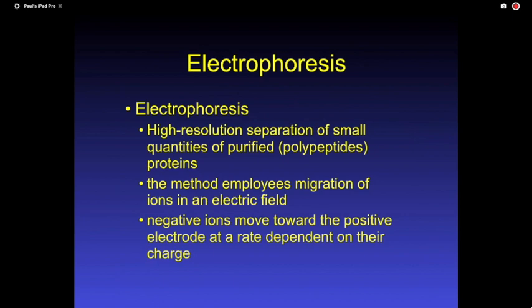Usually it takes a combination of 2 to 3 to 4 different separation techniques to get to a purified protein, a single protein which you can use to do your studies. Okay? But they're used in conjunction. And which ones you use depends upon, again, you hope someone's isolated your protein before and you just find out their protocol, they figured it out. If not, you do a lot of work to figure out how to isolate your own protein.